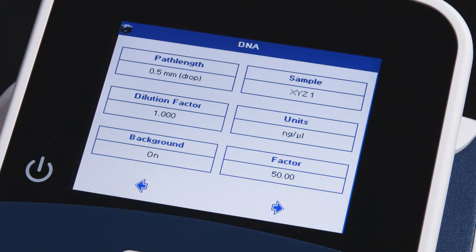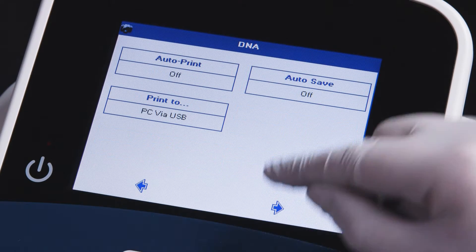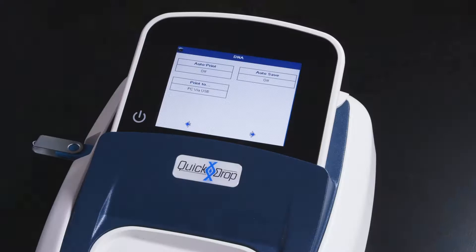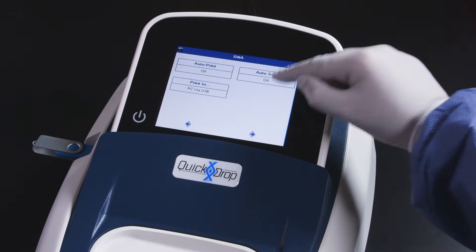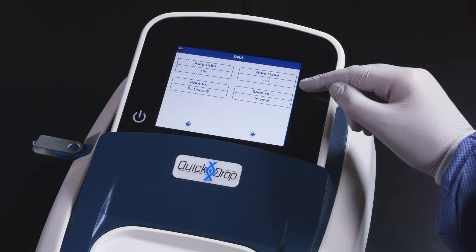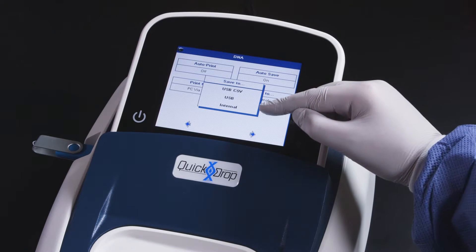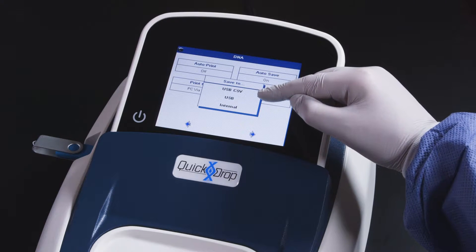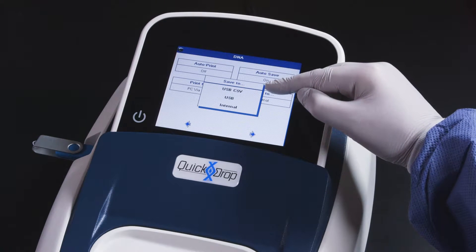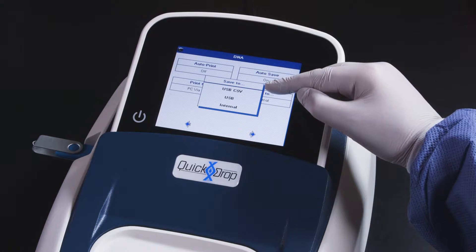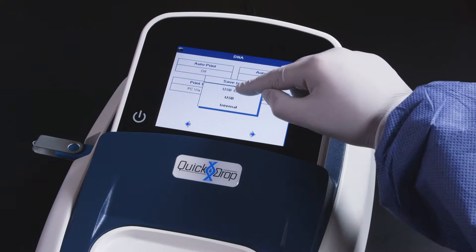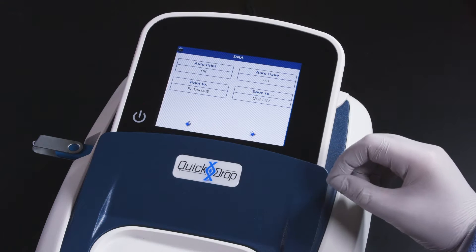In the next screen, you may set your autosave settings. If you have a USB inserted into the QuickDrop, you will have the option to save to the internal memory, the USB stick, or the USB in a CSV file, which is convenient for downstream data analysis. We'll select the USB CSV option.